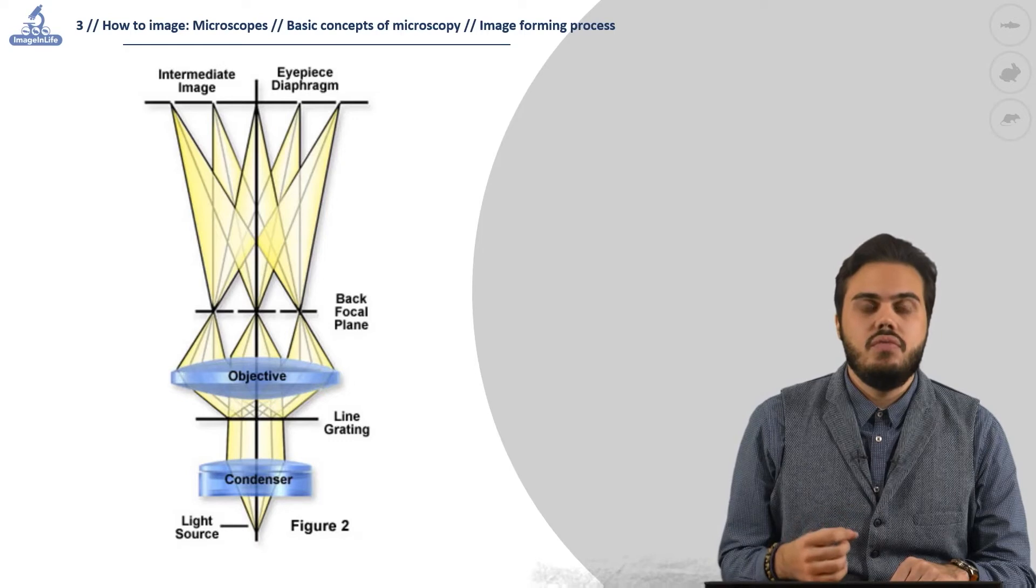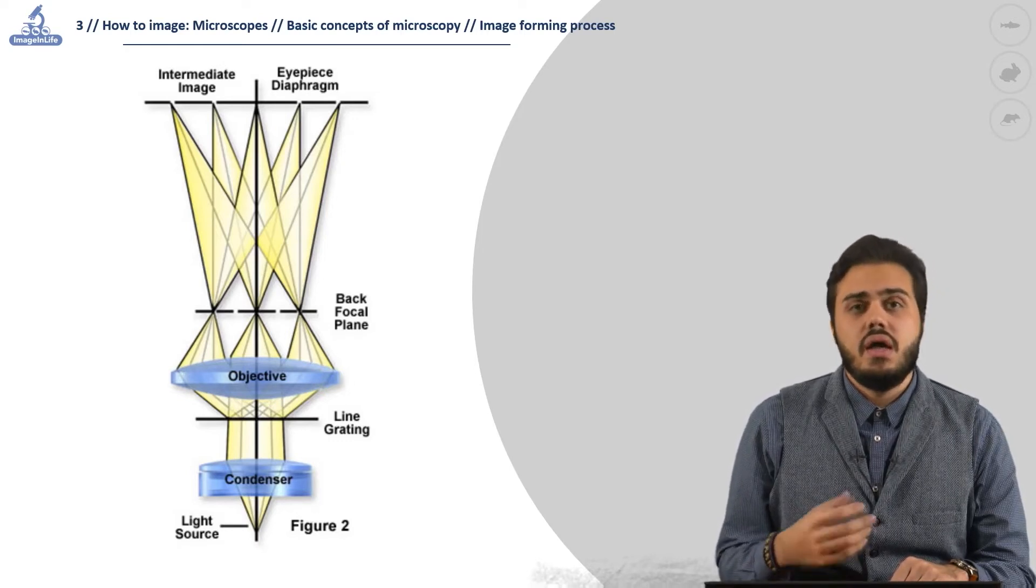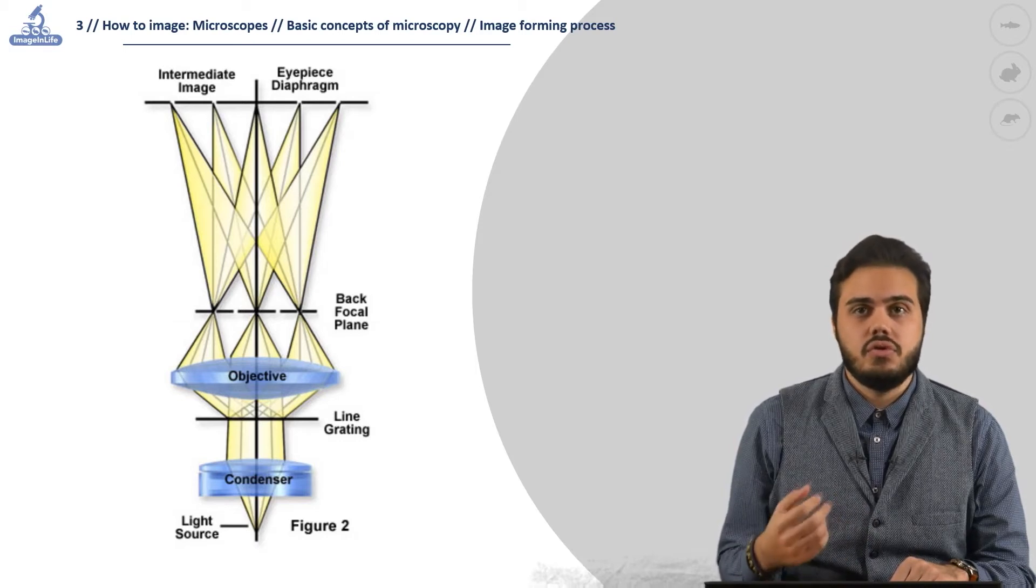In this unit I will give you a general understanding of the theory that will be detailed in the following units, and the easiest way to do it is starting with optical microscopy.